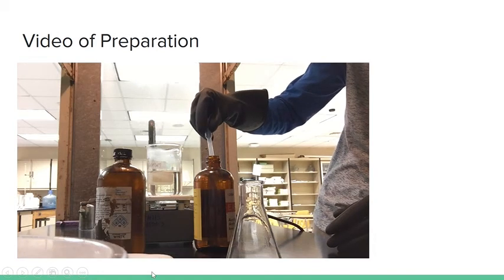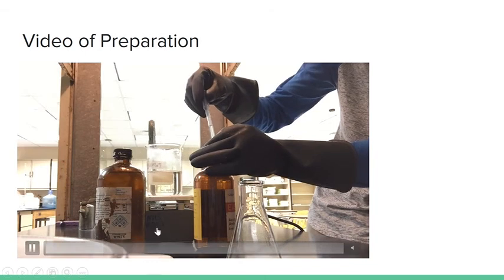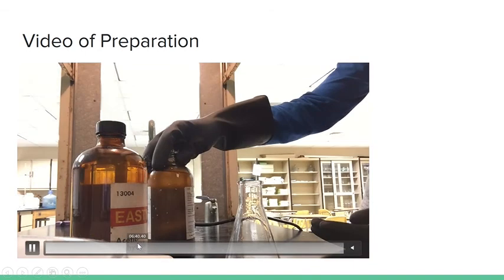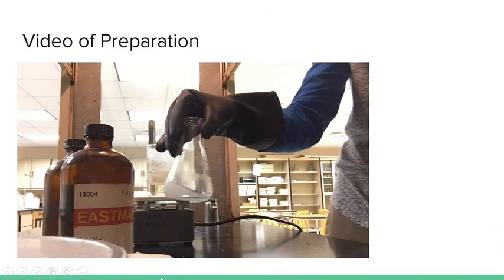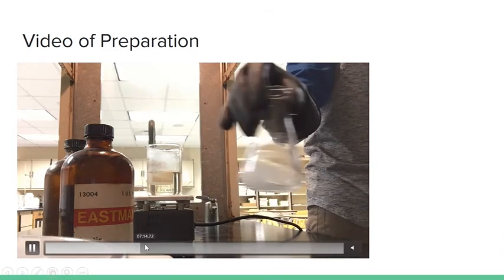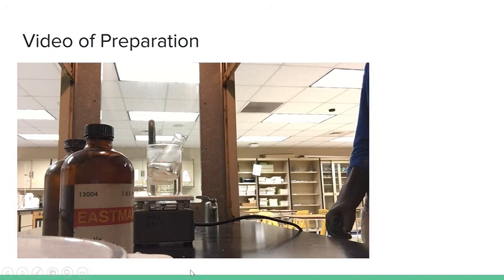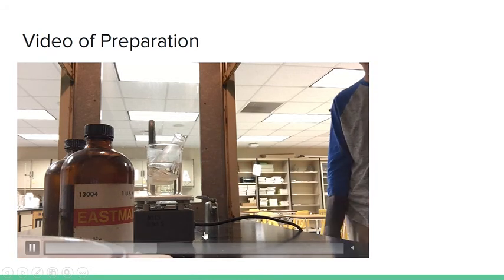Here I am taking the acetic anhydride out. We use 5 milliliters of it and pour it into the flask. This is mixing it all together after the sulfuric acid catalyst has been added. We swirled it around and then placed it in the hot water bath. Notice the color of it now.